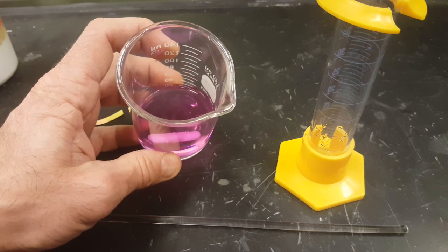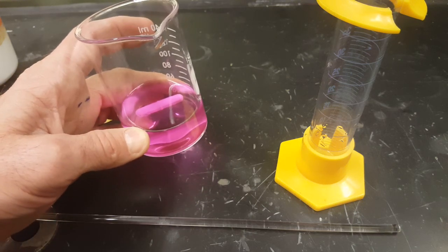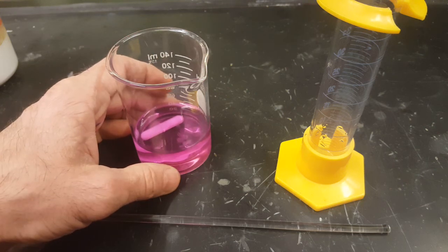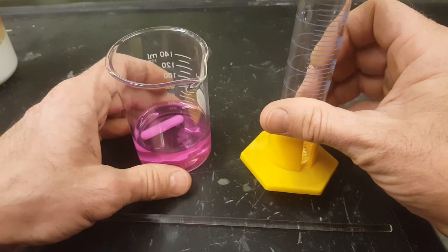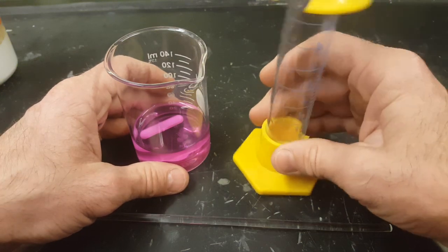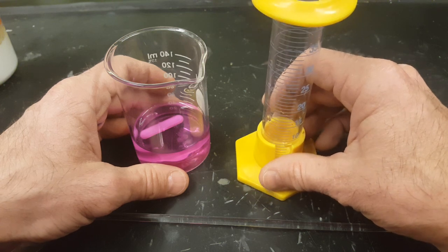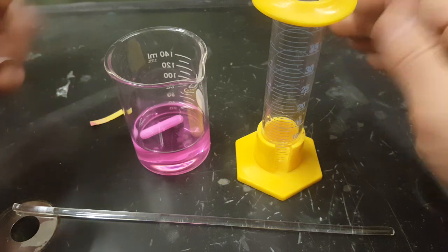Make sure that you rinse and dry your beaker and your flea so that it's perfectly clean for next period. Same with your graduated cylinder. Rinse it. You don't have to dry it. Just rinse it nicely with warm water in the sink and put it back at your station. All right. That's a titration. Good luck.